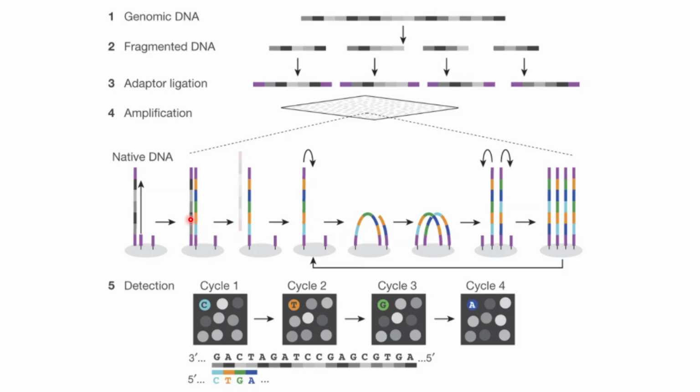And afterwards adenine is present here, so thymine will be added complementary to it, so it gives an orange kind of signal. And afterwards say cytosine is present here, so guanine is added here, so it gives a green signal there. And afterwards whenever a thymine is present here, adenine will be added and it will give a strong blue kind of signal.